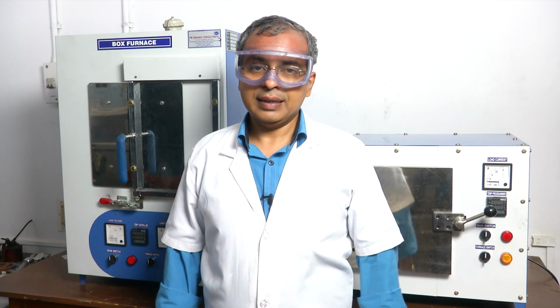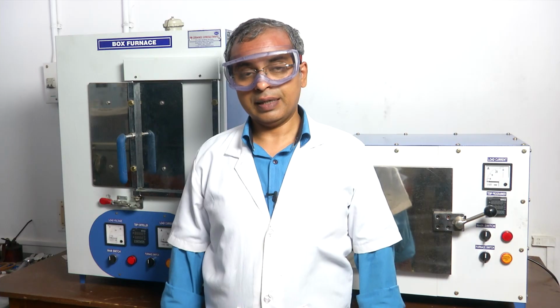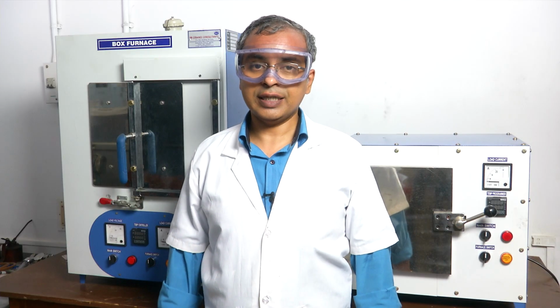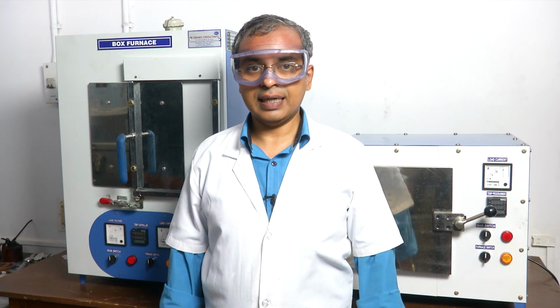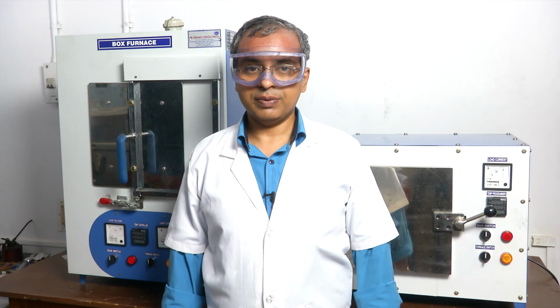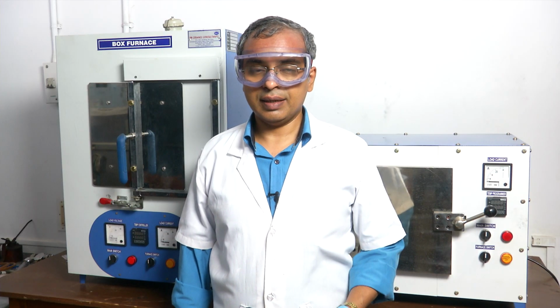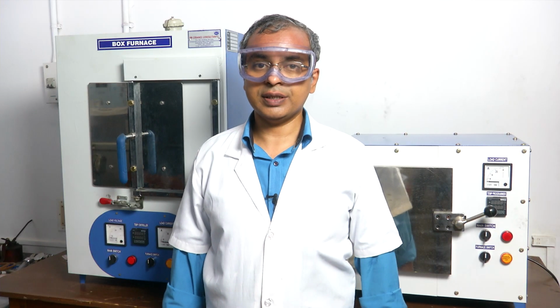Hello. In this section, as part of our discussion on research activities and especially a part of our discussion on experimental research activities, we will look at safety in our research lab setting. Now, safety is something that is a very broad subject. It is a subject that is dealt with in great detail in many occupational working condition kind of situations.